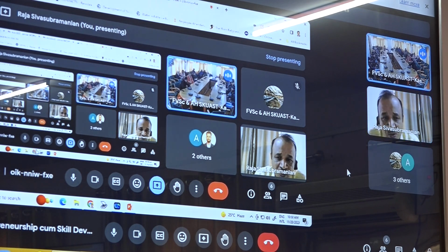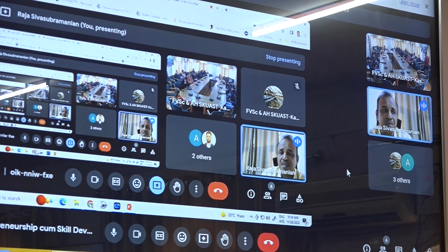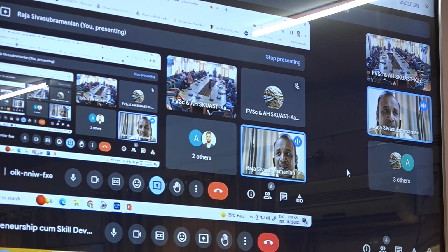And the next question is about nylon. In our lab, we normally use HCl for dissolution of nylon, but you mentioned some other chemical. No, same, nylon is nylon. HCl you can use, or formic acid. When we blend nylon for spinning purposes and then remove the nylon portion, we use HCl. But normally the standard solvent for nylon is formic acid. Yes, sir, formic acid can also be used for dissolving.